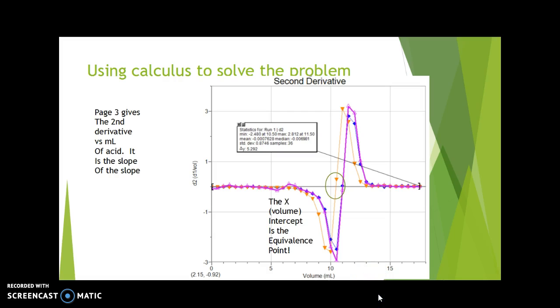The X-volume intercept, or the volume intercept, is the equivalence point. That's the volume of acid at which the moles of H+ equal the original moles of the hydroxide.